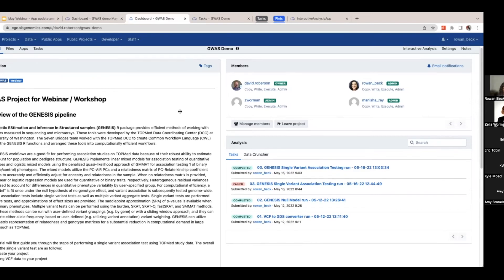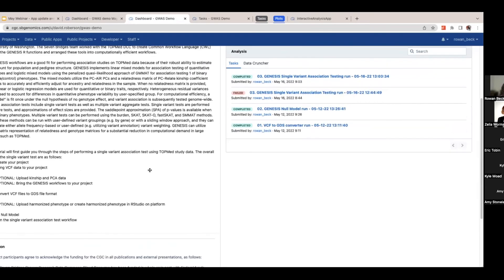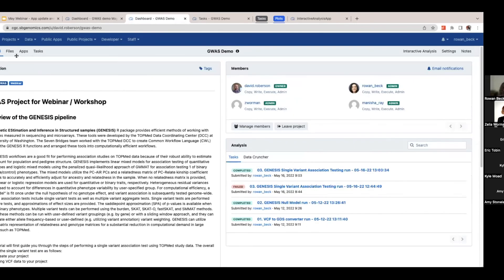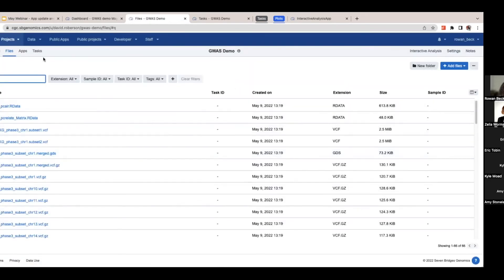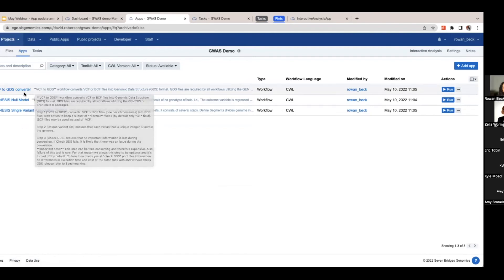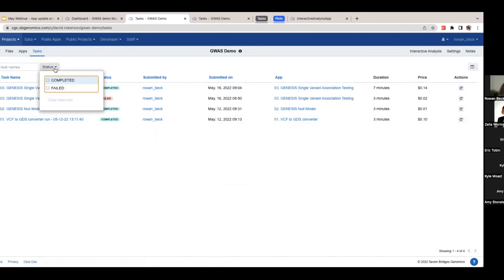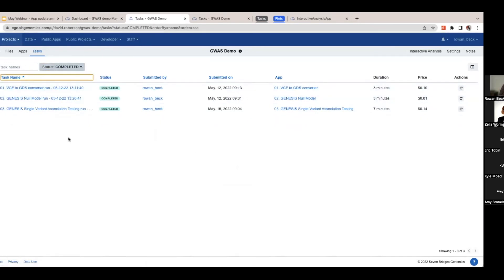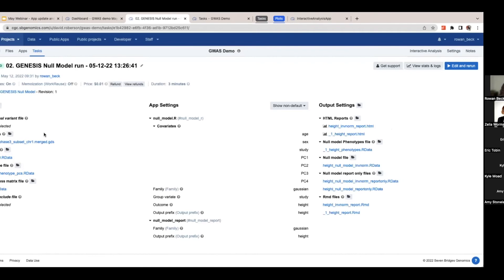In the project description, we have basic information about the GENESIS pipeline and how it works. On the right-hand side, you'll see some of the analyses I've already run. If you click the Files tab, you'll have access to all the files used today. Click on Apps to see I've already preloaded the three I talked about: VCF to GDS converter, the GENESIS null model app, and the single variant association testing app. You can see the tasks that have been run — sorted by completed, failed, whatever you'd like — which gives you access to see what I've already done. If you're trying to replicate something and don't know which files I used, you can use this as a reference.